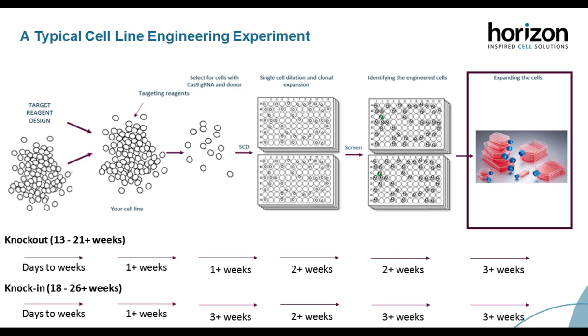So it's about considering all these risks in your experiment, and these are what I'm going to go through with you today so that you can find your genotype faster and get your cell line faster. The main considerations to take are the 7 displayed on this slide here. We're going to go into each of these, and throughout this process I'm going to highlight ways that we in the cell engineering team minimize the time spent on each of these steps so that you can maximize your gene editing success. These will be tools that Horizon have generated in-house, as well as tools that we use from free online resources.